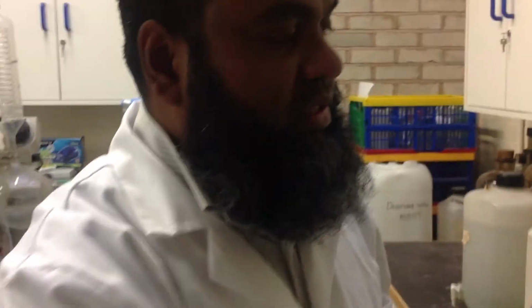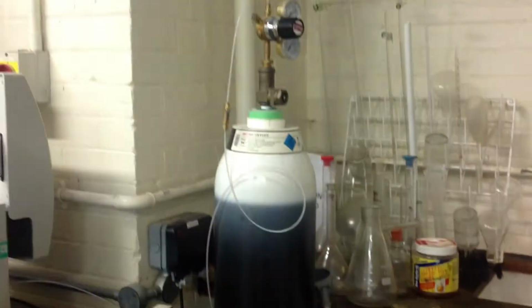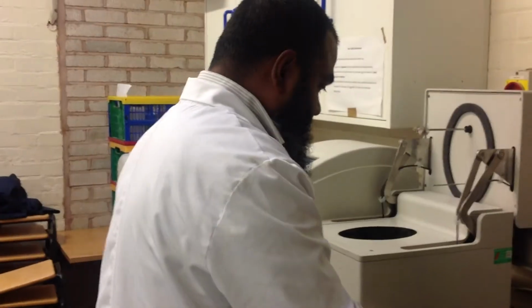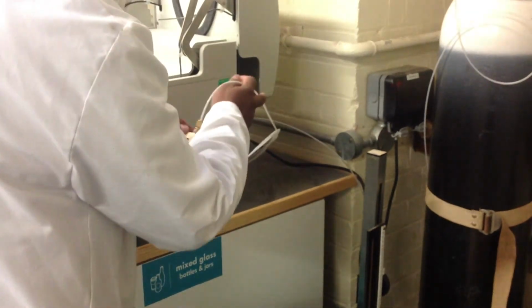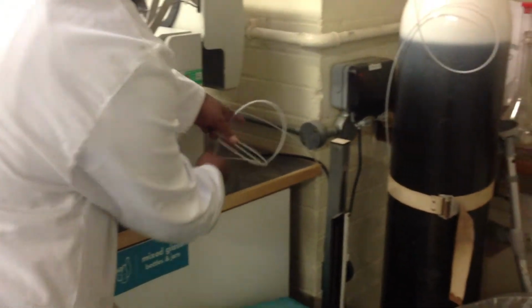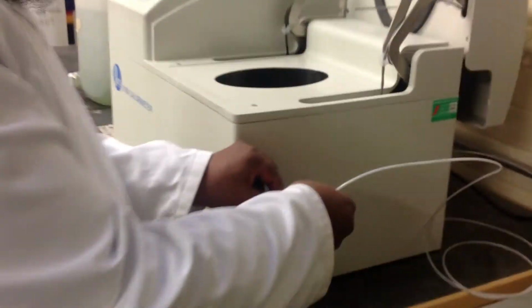And this is the oxygen cylinder here. We need oxygen for combustion. So let's connect this oxygen hose into this vessel.